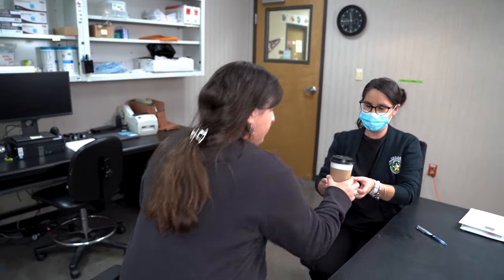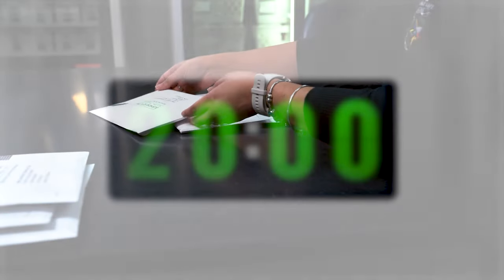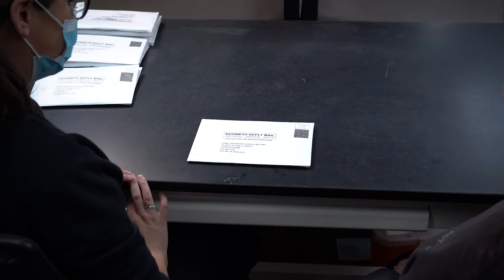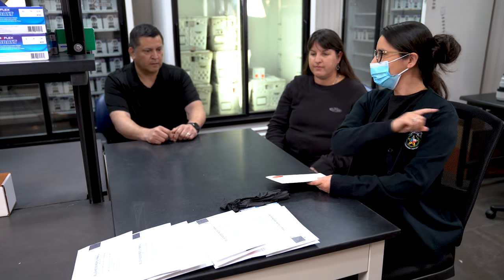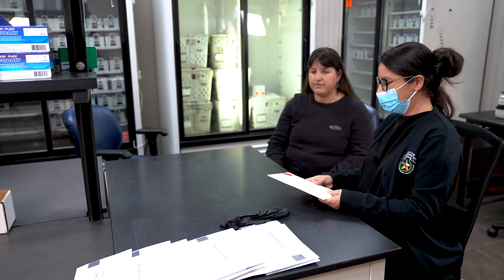Before opening a kit, verify that the subject has not had any food or drink other than water within the past 20 minutes. If the subject has had food or drink, wait 20 minutes before proceeding with the collection. Ensure your collection area is clean. Do not open more than one kit or collect samples for more than one subject at a time. If possible, do not have more than one subject present within the collection area. Following these instructions will minimize the accidental mixing of samples.